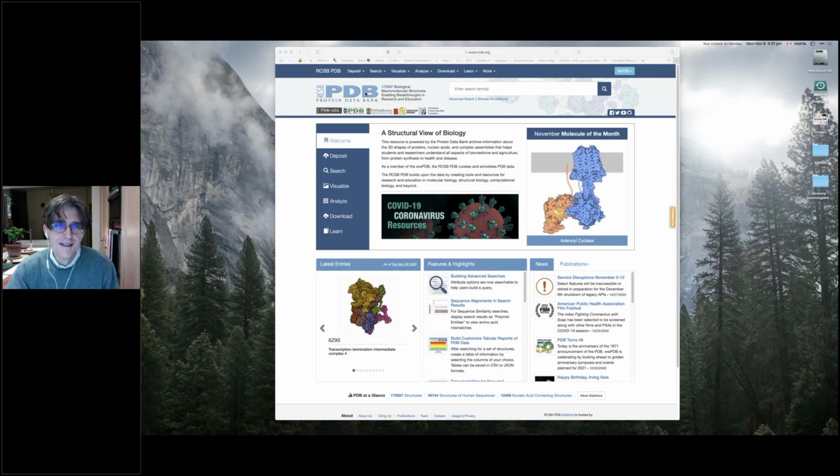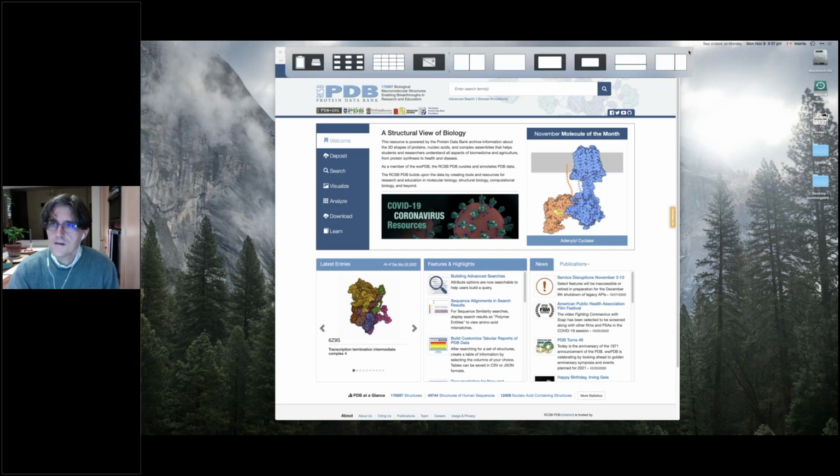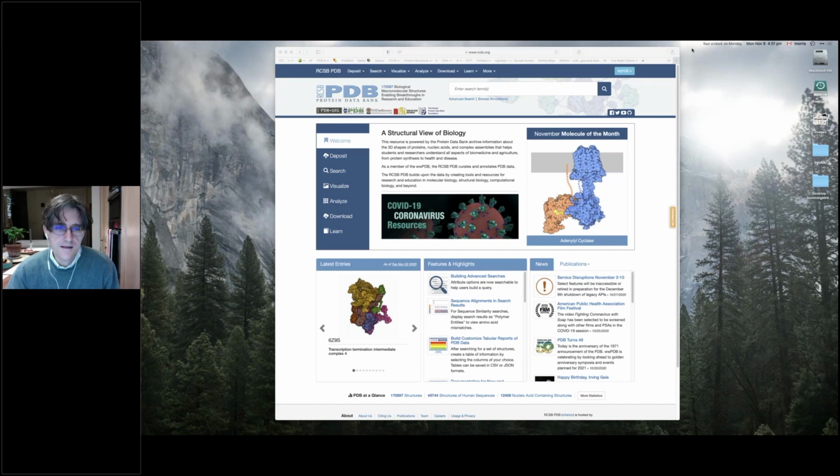Thank you, Chris. So as Chris said, I'm going to make this as interactive as we possibly can. What I'm going to do is talk through various aspects of PyMOL and things you can do with PyMOL. I'm going to give you a tour of the interface and a little bit about how to use the mouse. A little bit about colors, how to color molecules, a little bit about selections.